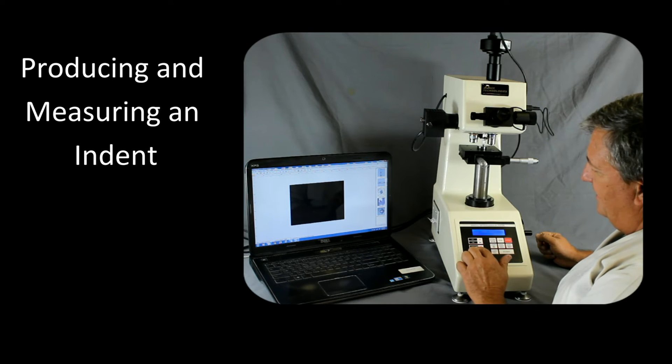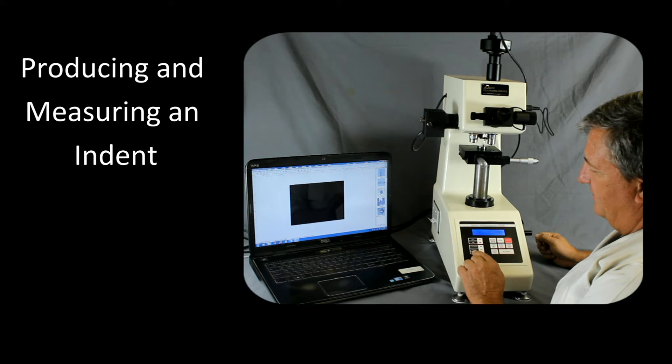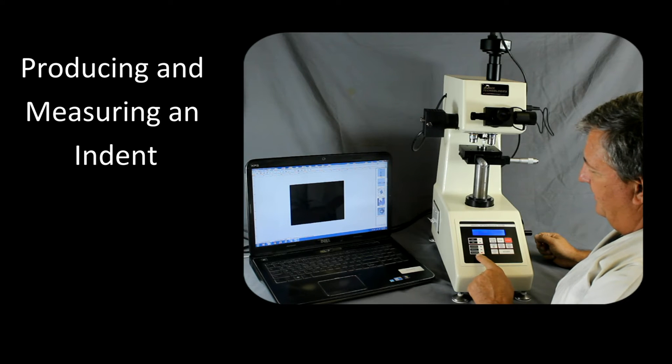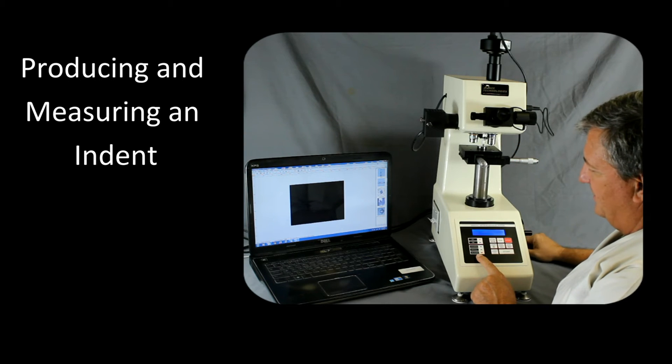You'll see it begins to load. Once loading is complete, it goes over to the dwell, which is preset. The dwell is shown here and will count down to zero. After the indent is completed, it will go to an unloading cycle. During this whole process, you don't want to be moving anything, because that's how you damage or break your indenter.